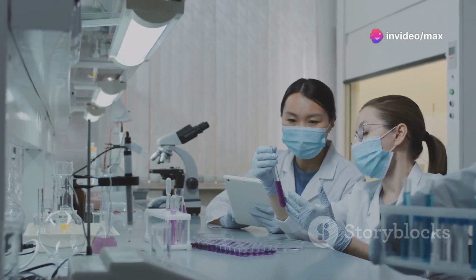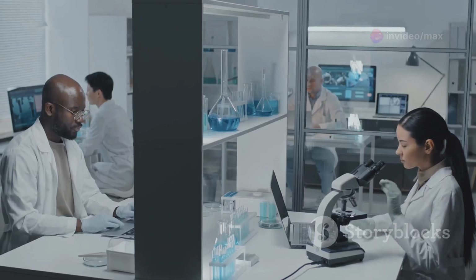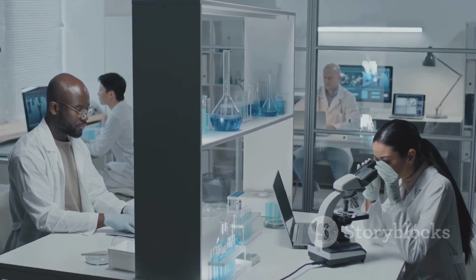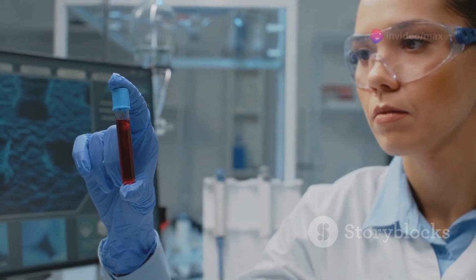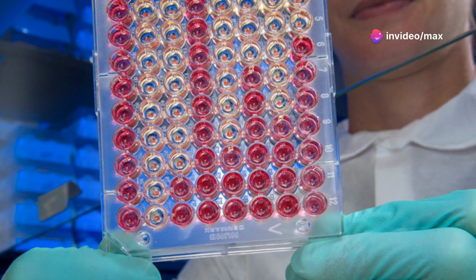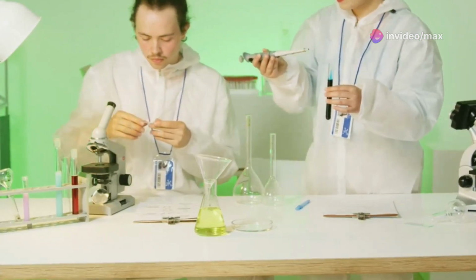In the vast universe of biological research, scientists are often looking for tiny clues. These clues can help us understand diseases, develop new drugs, and even track down criminals. One of the most powerful tools in this quest is the ELISA. ELISA stands for Enzyme-Linked Immunosorbent Assay. It's a mouthful, but it's really quite simple.